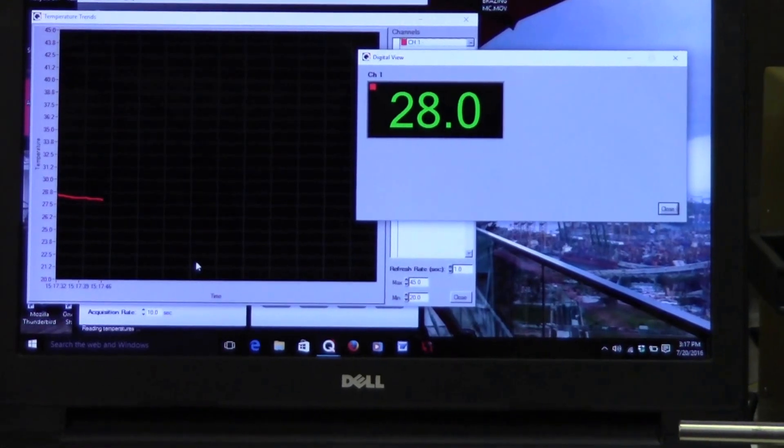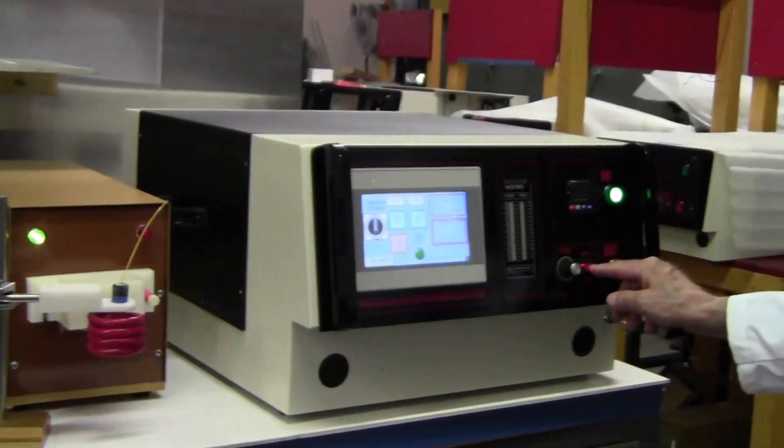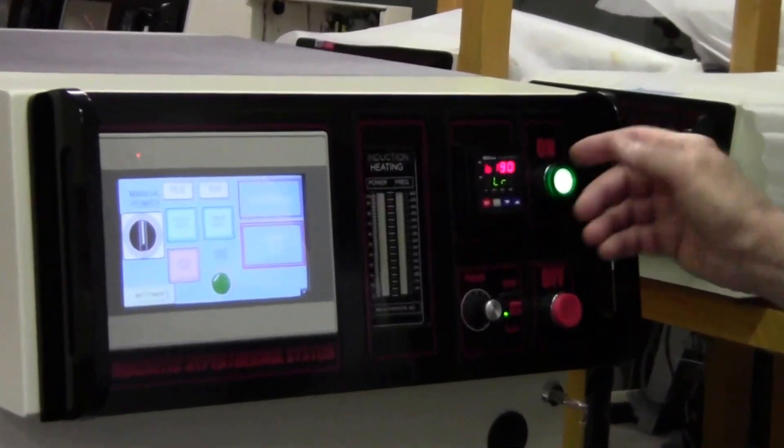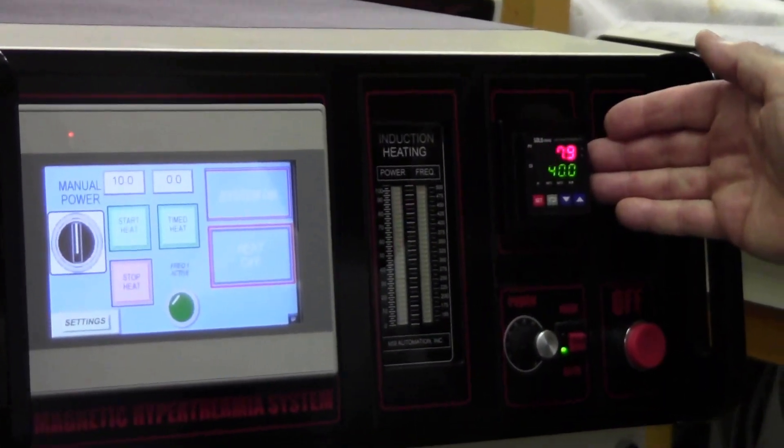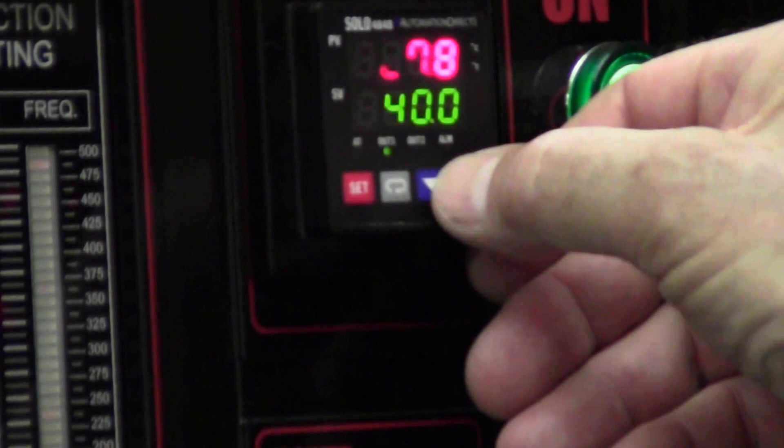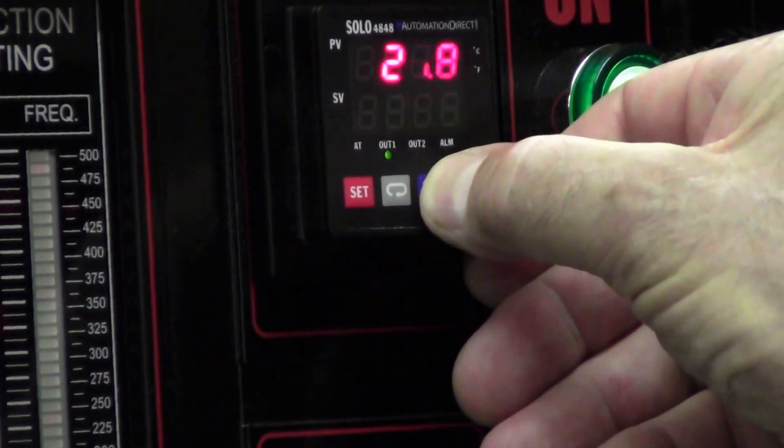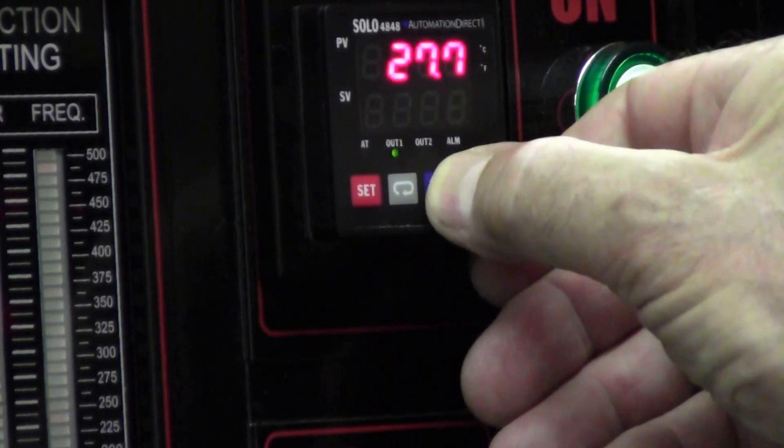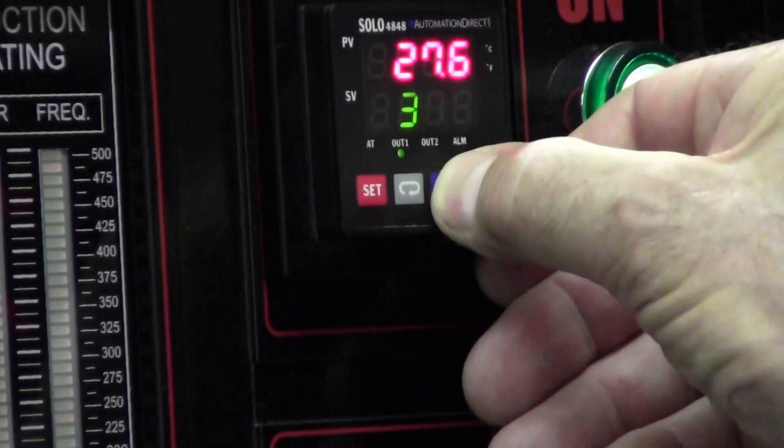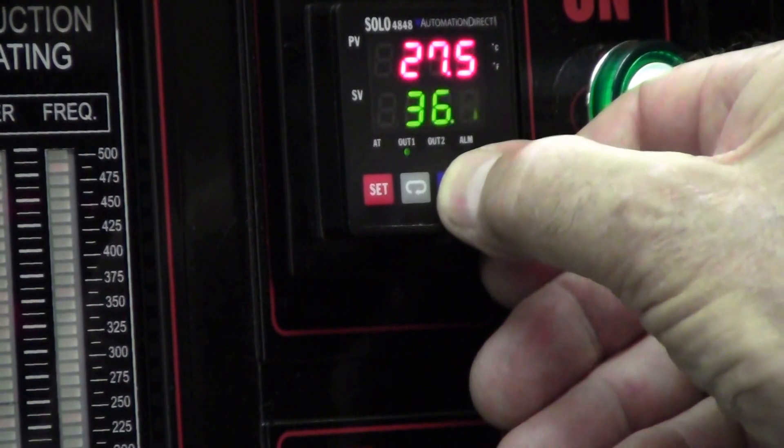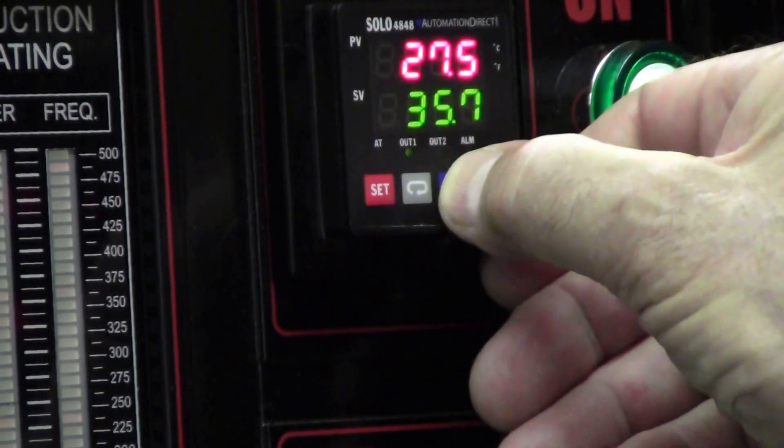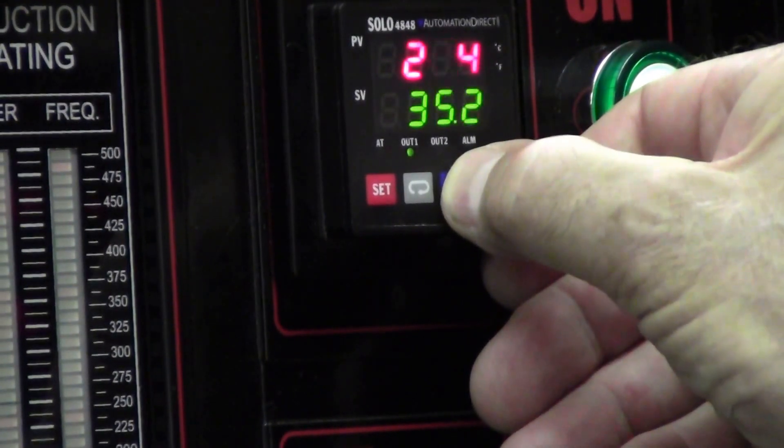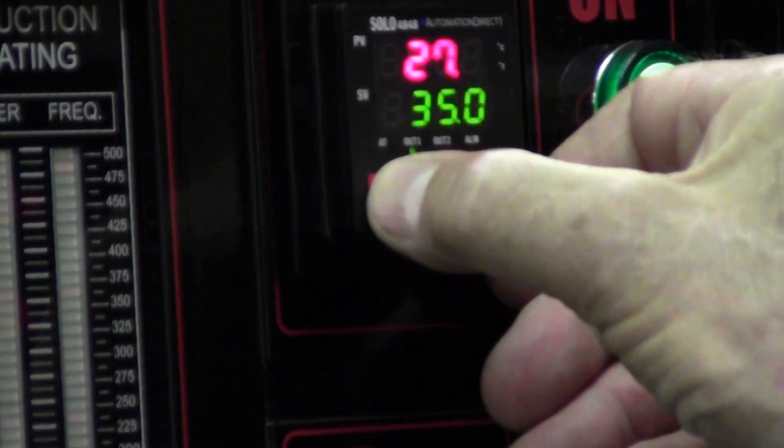This time we're going to use the temperature controller. Swing back over here. You can zoom in on it. I'm going to reduce the set point to 35 centigrade. Then I press set.